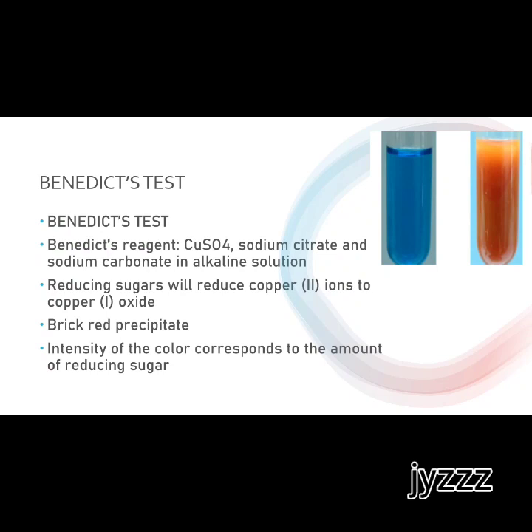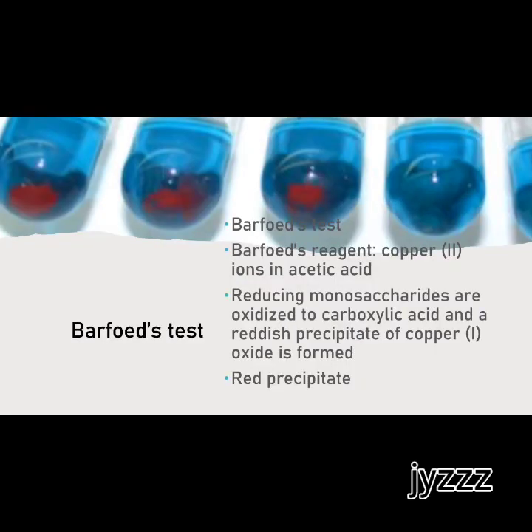Here we have your Barfoed's test. It utilizes your Barfoed's reagent, which is your copper ions in acetic acid.